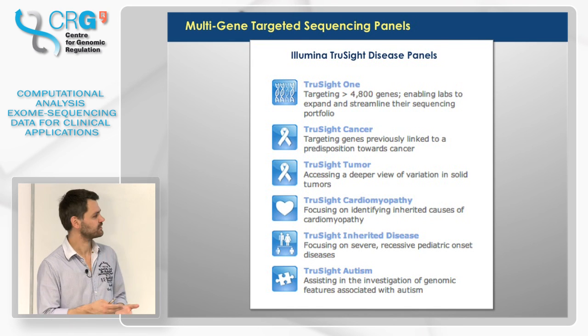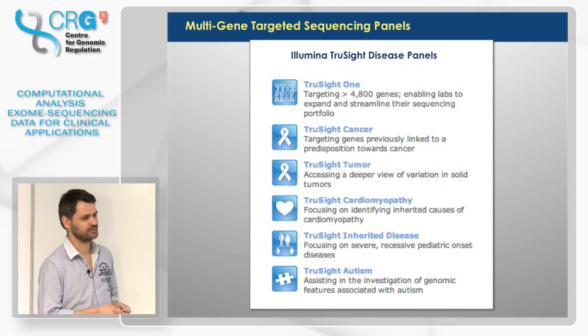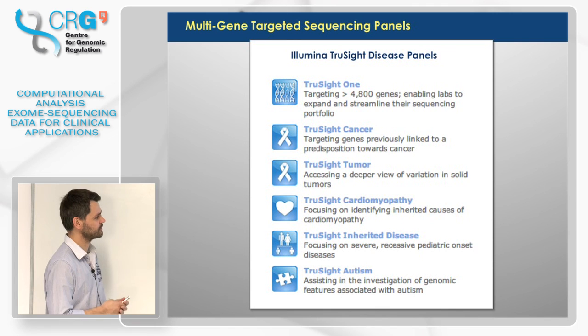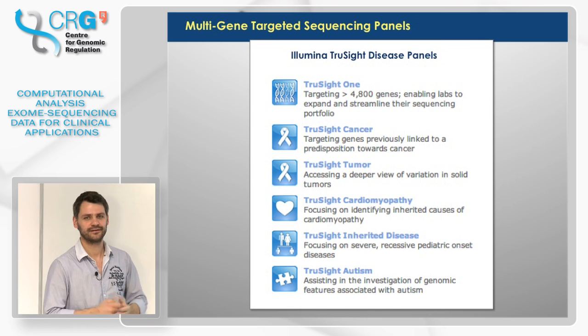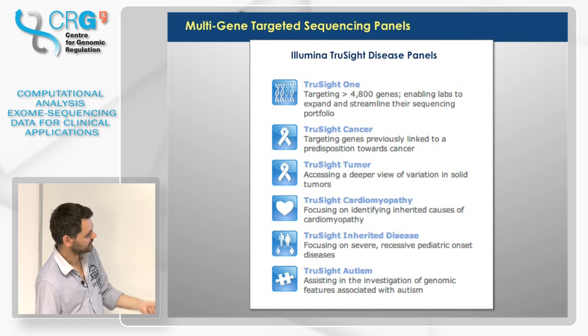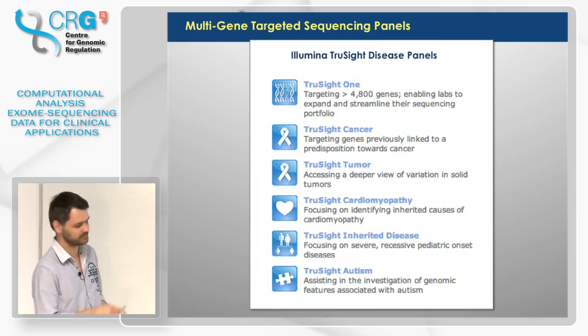200 genes. There are many advantages. You can sequence much more in one lane, so it's much cheaper. Second, you do not have to care about incidental findings in genes that are not important for you, so you don't have to think ethically about the implications if you find out that this person gets Parkinson's soon. And in general, the analysis is simpler. For instance, if you do 200 genes, you get a file about 100 times smaller than from exome. So even on Galaxy, you can easily analyze several without getting into space problems. I think that will be the first application that will be very broadly used in the hospitals before exome even becomes the norm. Many hospitals will first start with the targeted panels.